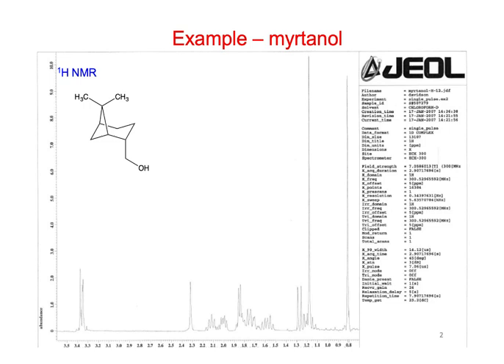Okay, so this is kind of where we stopped, and I'm going to run through examples that are not only just 2D, but I've got a data set for this compound. We talked last time about terpenes and how this is a terpene, and that helps us sometimes put things together if we know there has to be a repeating pattern of atoms.